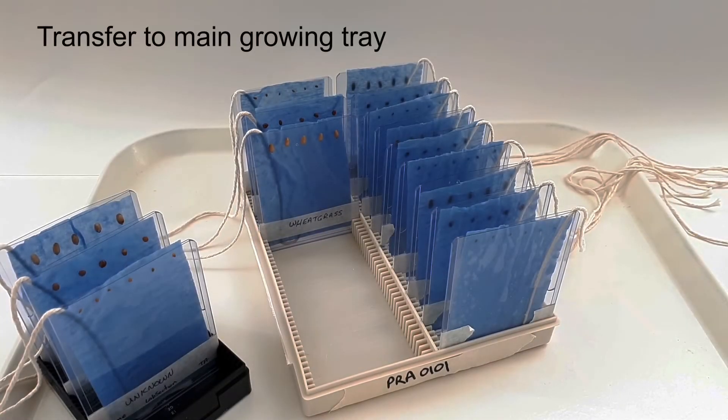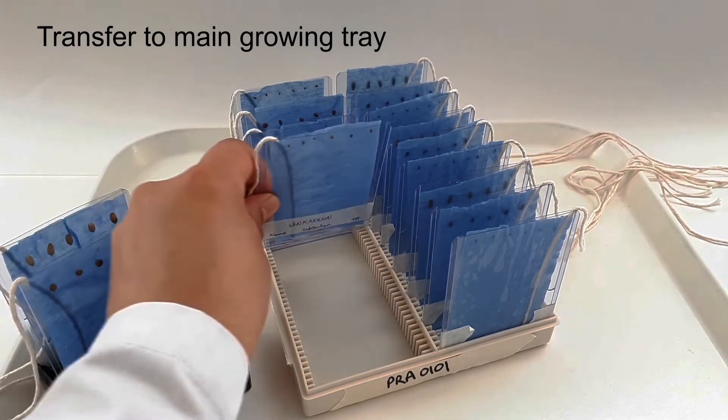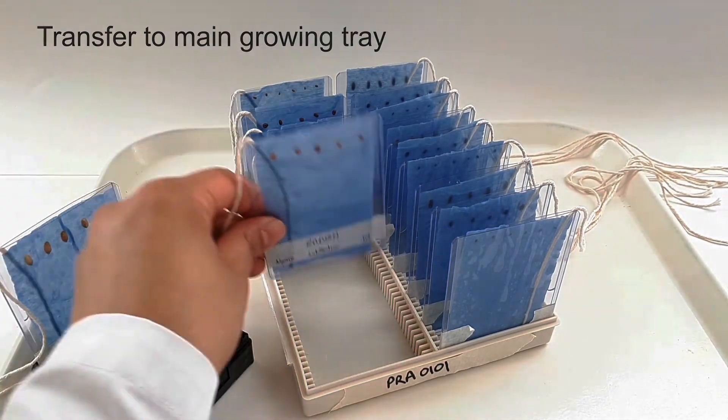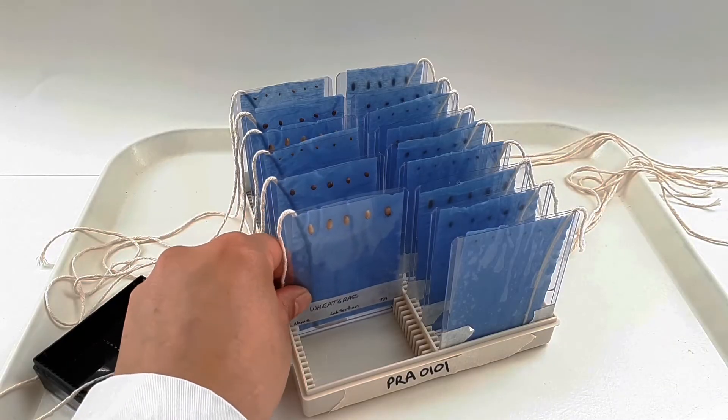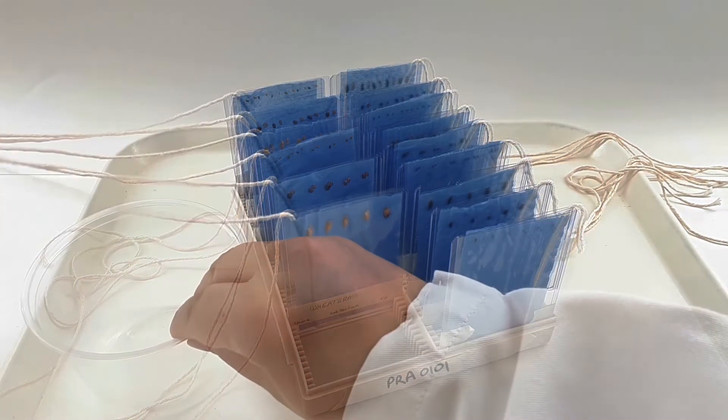Your plant pockets are ready. Place them into the main tray for your lab section. The pockets should be placed four to five spaces apart, with the strings positioned towards the sides of the tray.